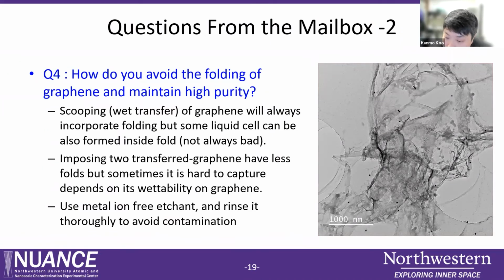The best thing you can do, in my opinion, is to use the highest quality graphene you can get, with a very large grain size and low impurities. For removing contaminants, you can float your graphene longer and several times on warm water to rinse off the contaminants.